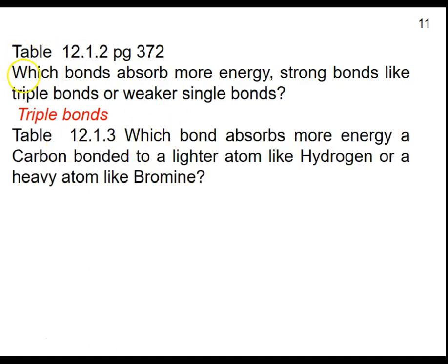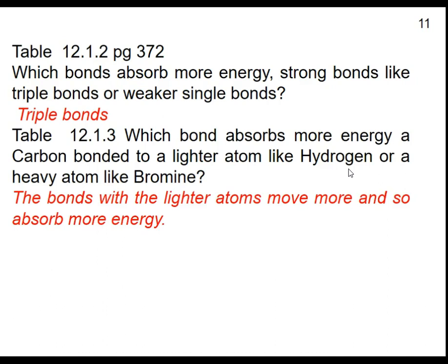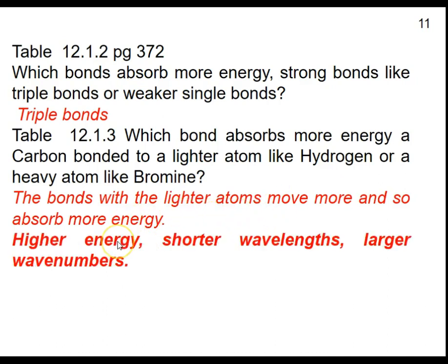Which bonds absorb more energy? A carbon bonded to a lighter atom like hydrogen or a heavy atom like bromine? This seems counterintuitive. It's the lighter one. They can move around more freely. So lighter atoms absorb more energy and would have peaks up in the high energy area.